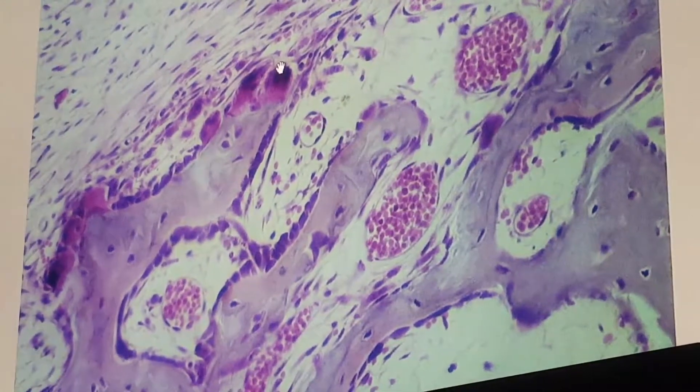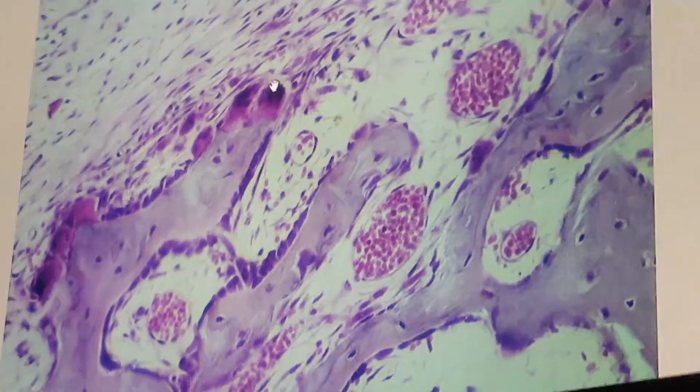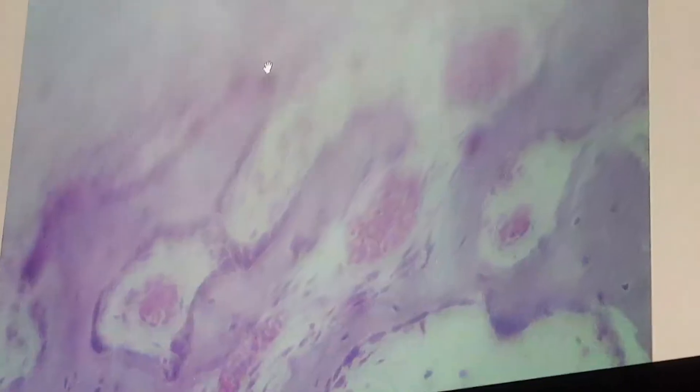This slide is stained with a trichrome stain. The last slide is a section of developing bone. We will examine the epiphyseal plates. Endochondral ossification is responsible for the growth of short and long bones.